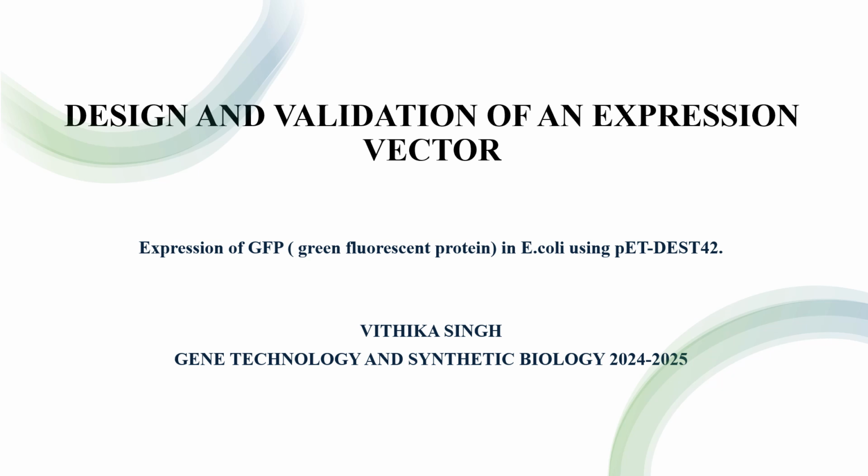Hello everyone, my name is Vitika Singh and today I'll be presenting my project on designing and validating an expression vector for GFP expression in E. coli using the PET-DEST42 plasmid. In this presentation, I'll cover the reasons for choosing GFP, the cloning strategy, vector design, transformation, validation, and expression analysis.